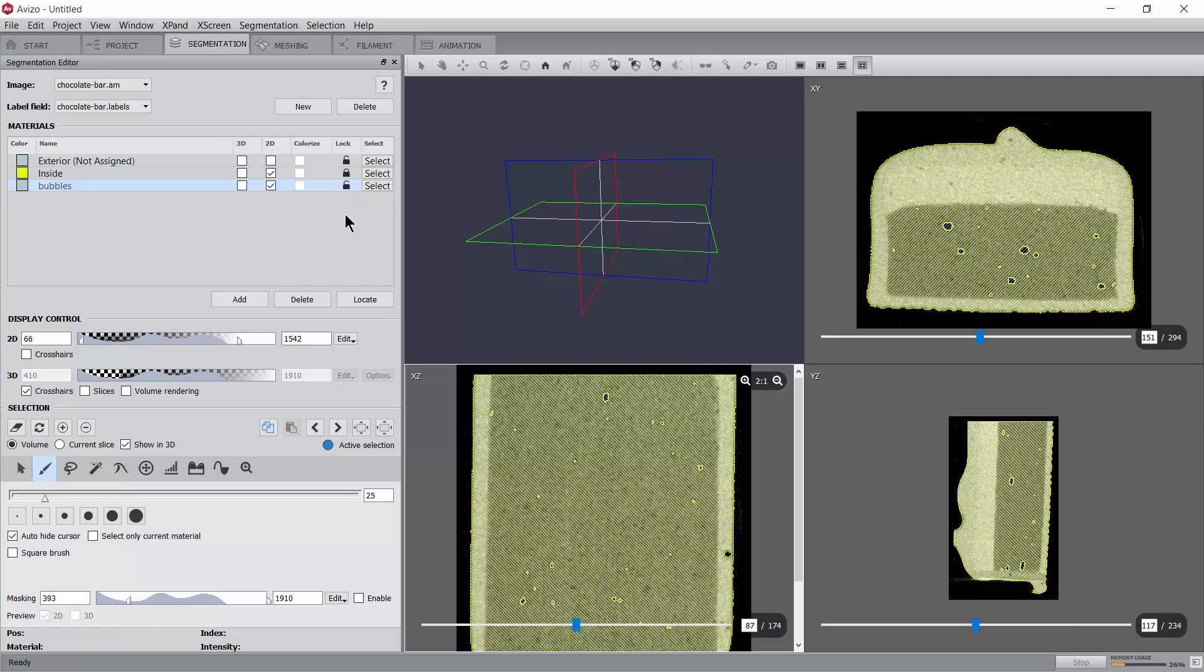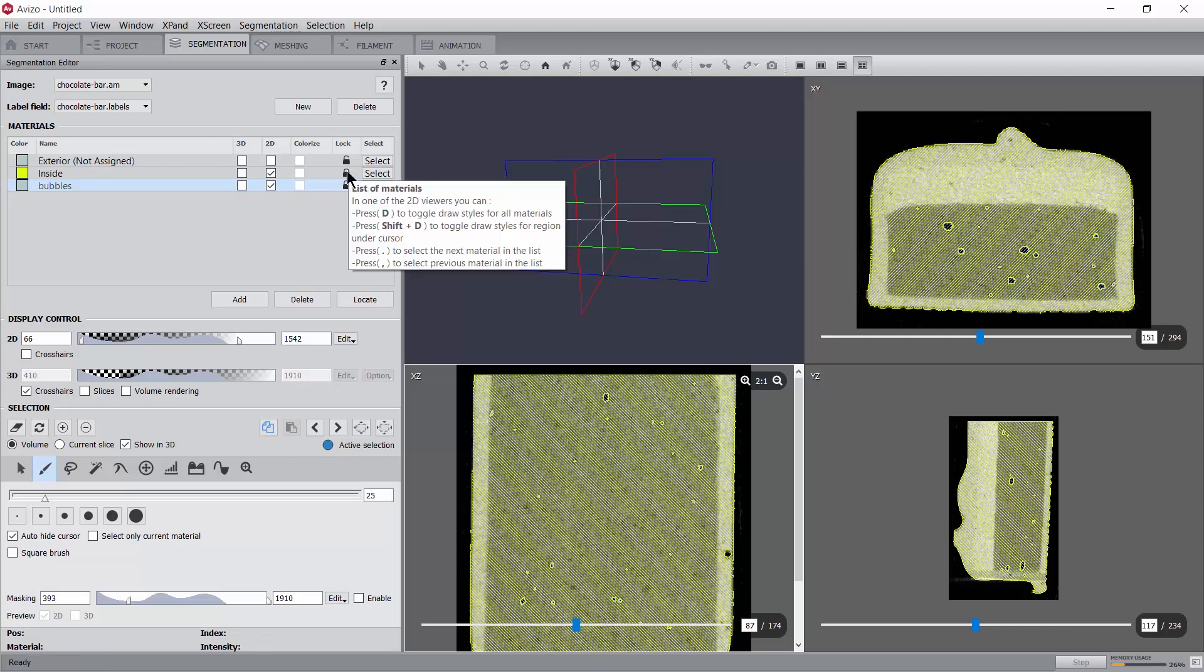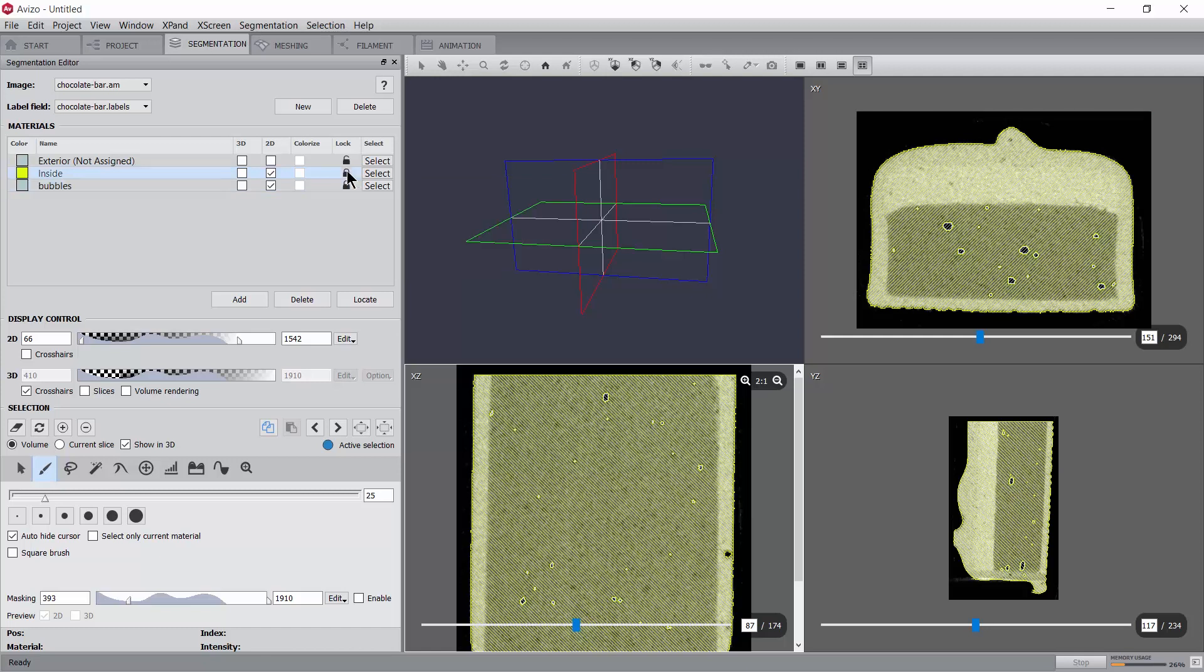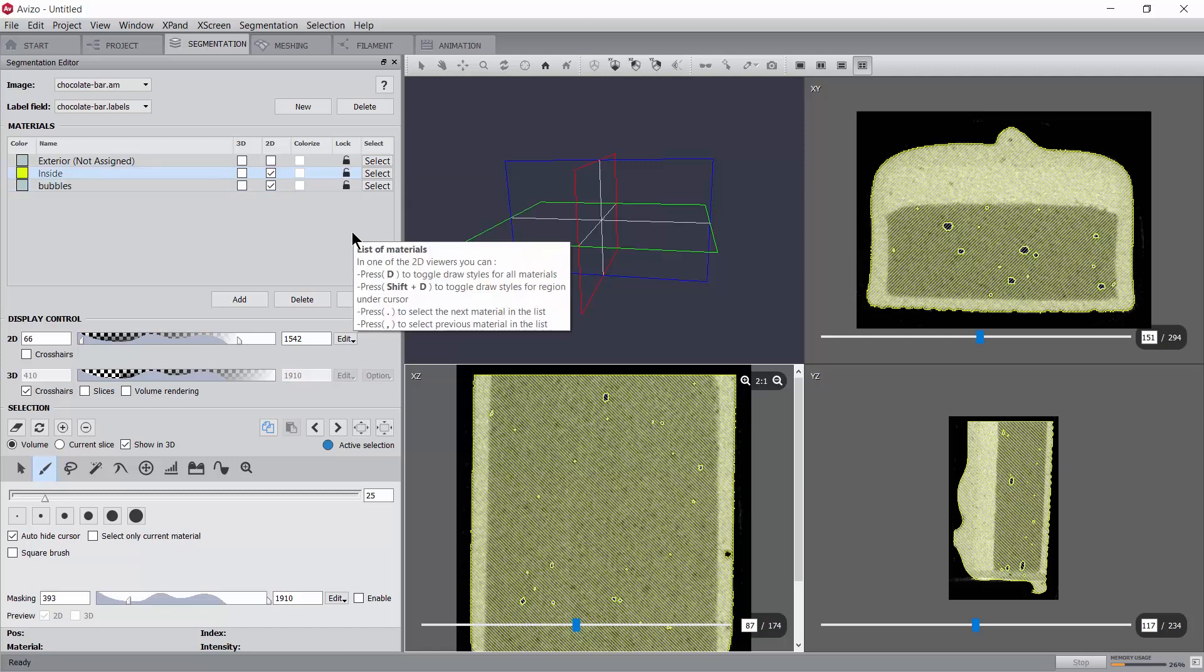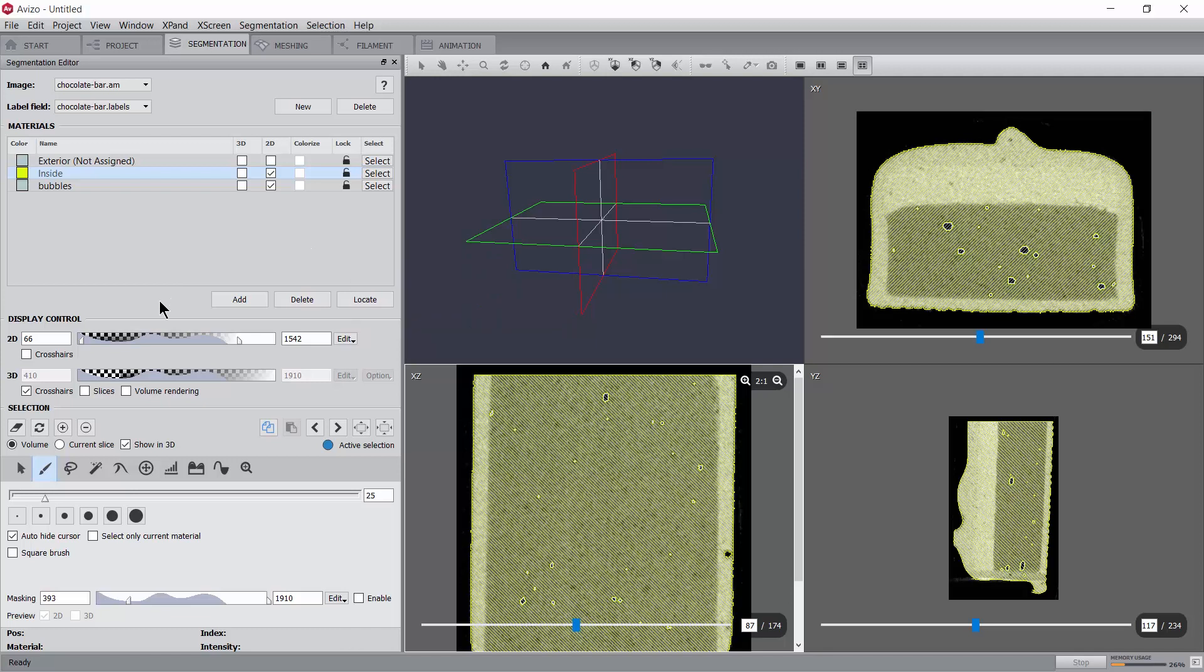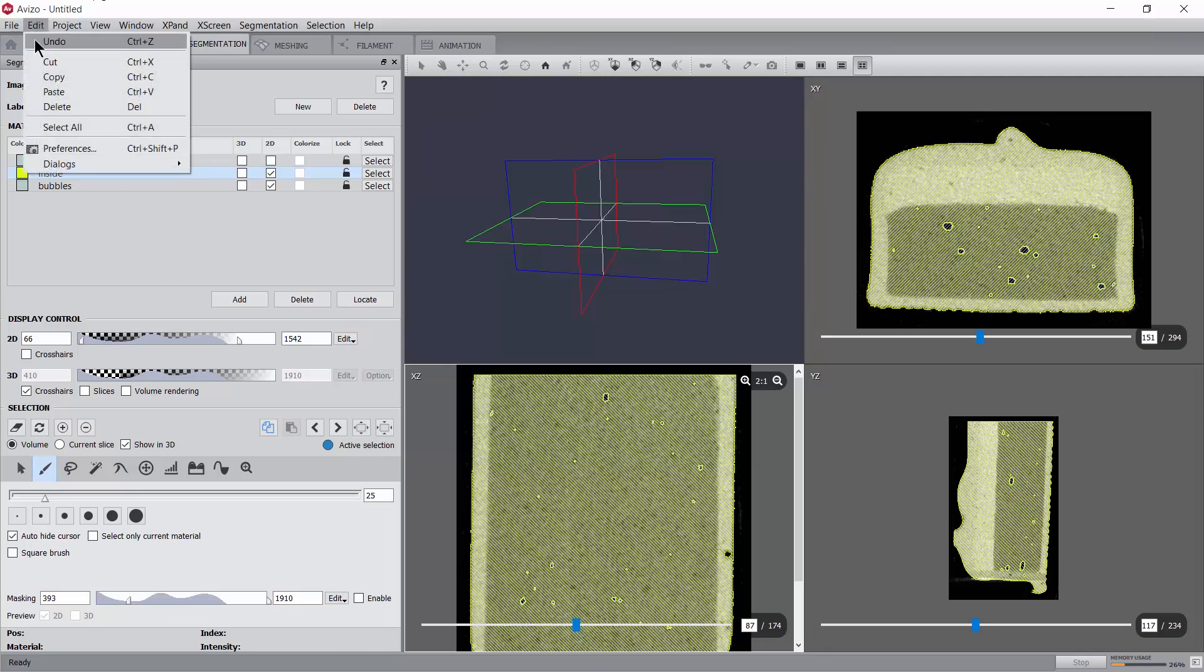Please note that the segmentation editor offers the option to undo the recent actions in case a mistake was made.